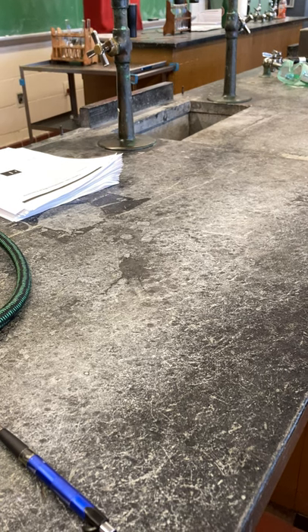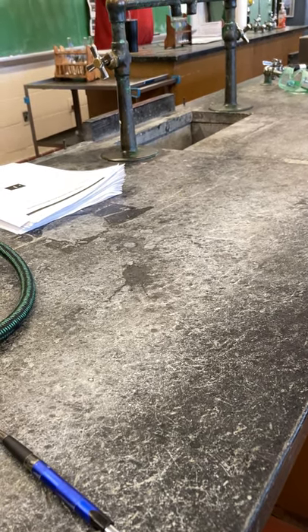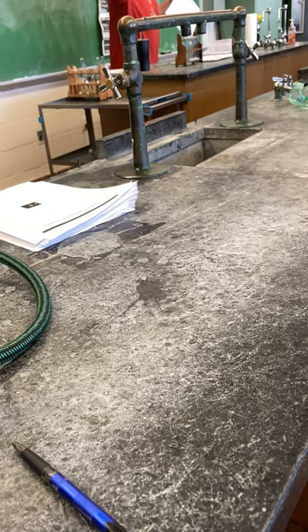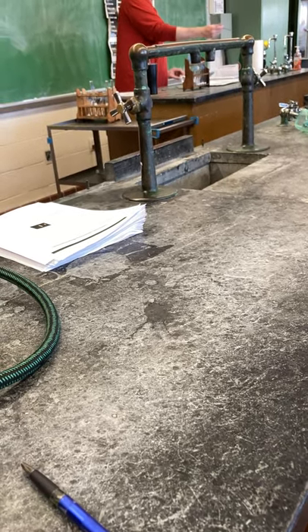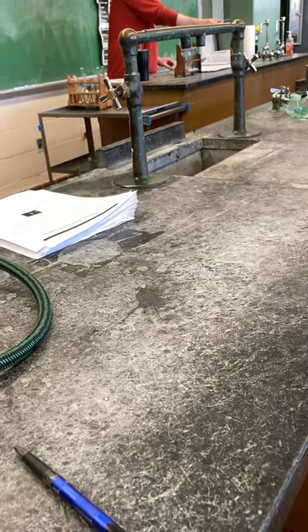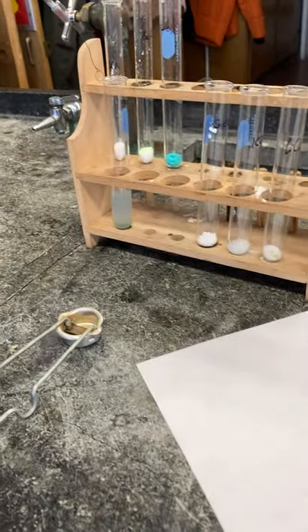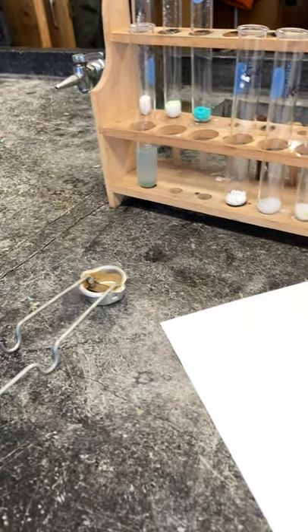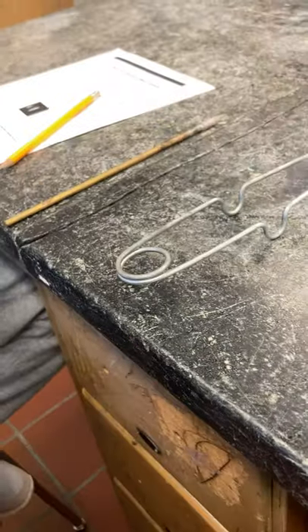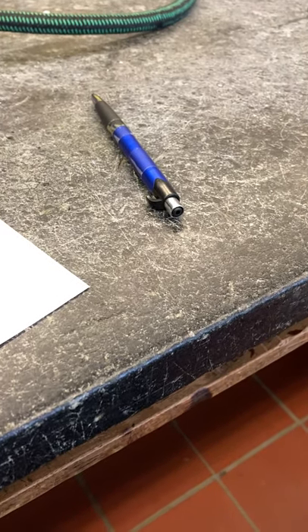Now, I'm seeing this lab station, I'm going to trade so you guys can get a little bit fewer samples. But as you go through, try not to mix one chemical into the next. So after you burn, we'll dip in the water, and then we dip into the chemicals, and we'll get more flame patches again. So you'll repeat these steps. Once you go through, the last one is an unknown. So I don't know yet. That one we're looking to identify, to see if we can identify which elements are in there. The very last page is the analysis.